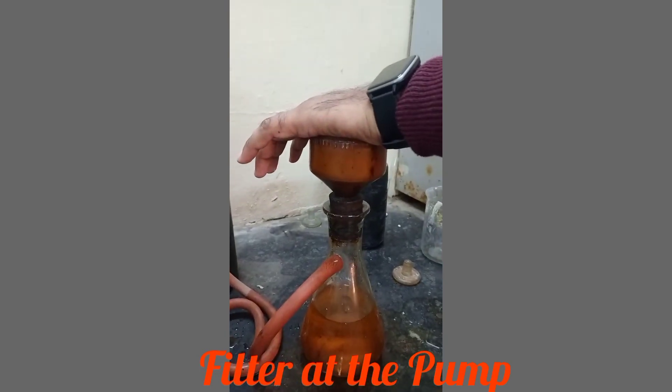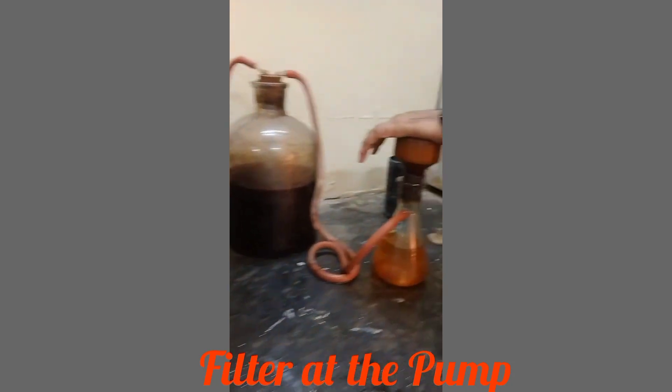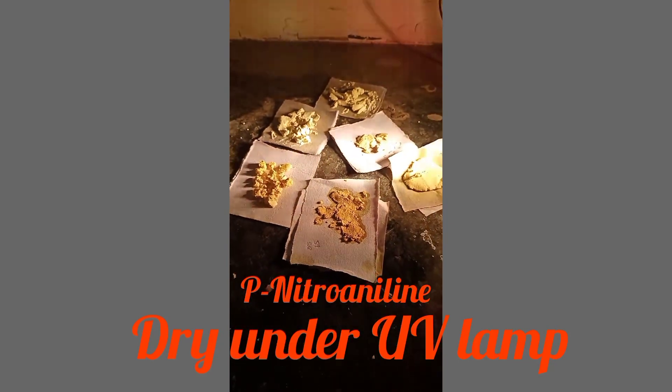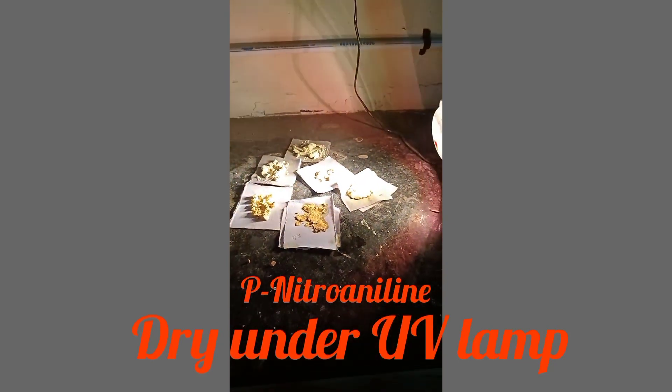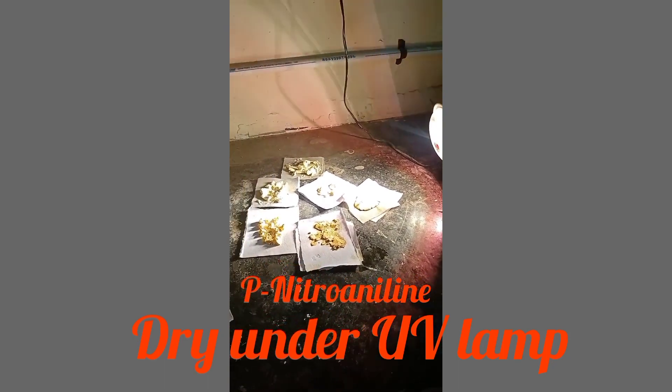After complete filtration at the pump, wash well with water and drain thoroughly. Under UV light, the product appears as a dark yellow powder with a melting point of 147 to 148 degrees Celsius.